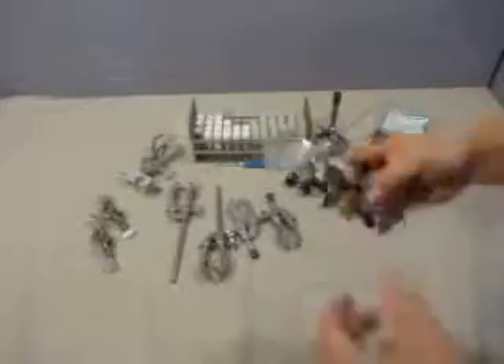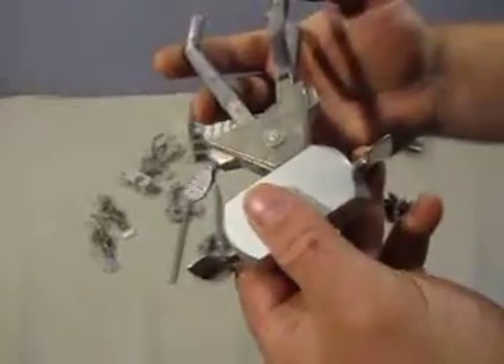Then we've got some clamps here, made by Castology — Fisher USA. It's got a clamp there, and we have two of those.